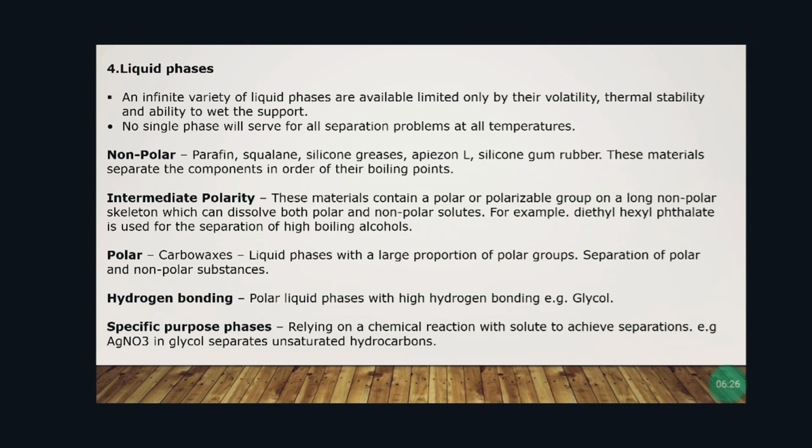Now the fourth part is liquid phases. An infinite variety of liquid phases are available, limited only by their volatility, thermal stability and ability to wet the support. No single phase will serve for all separation problems at all temperatures.